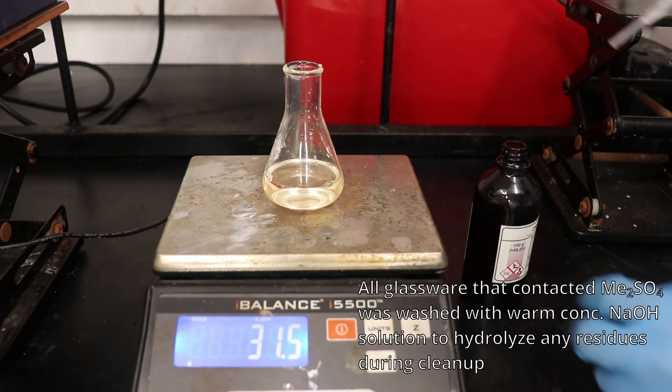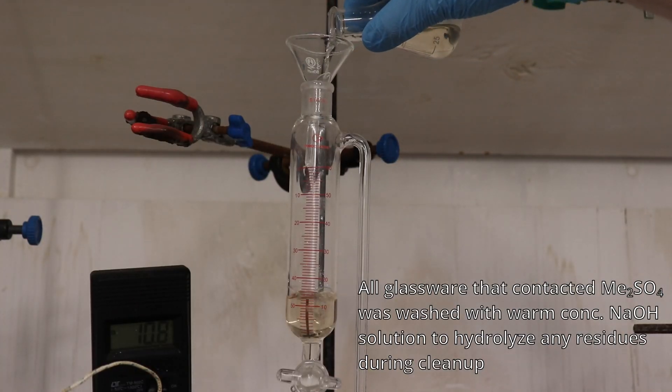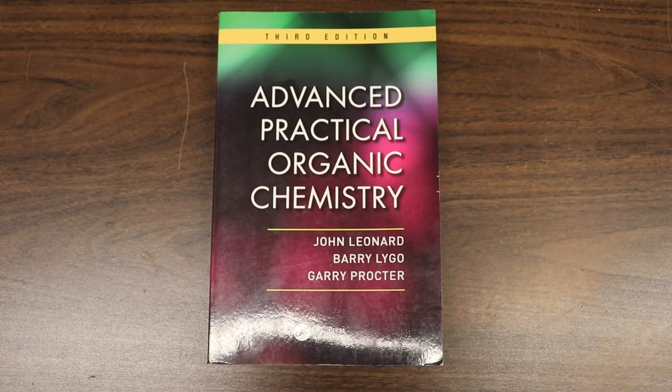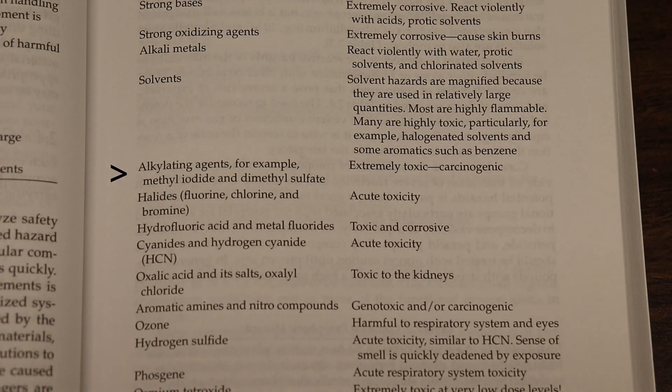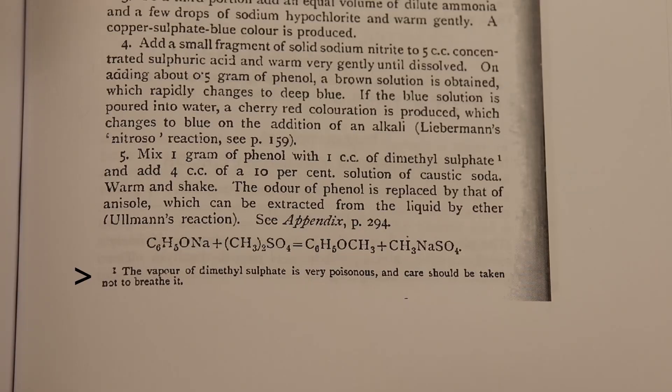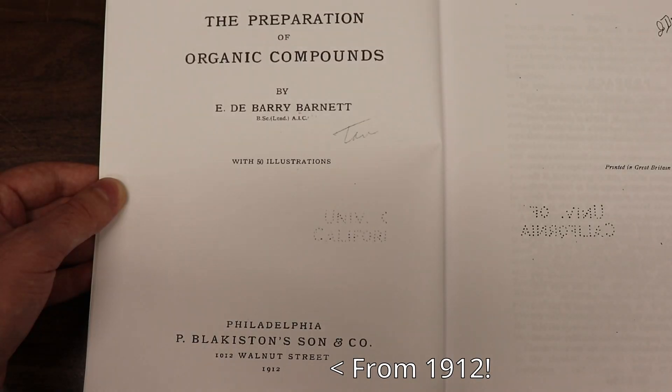Next, 31.5 grams of the extremely toxic dimethyl sulfate is weighed out and added to the addition funnel. If you choose to work with dimethyl sulfate, you need to be very aware of the risks that it carries, especially the non-obvious ones, such as its ability to build up to lethal concentrations in air at room temperature, which necessitates the use of a fume hood.